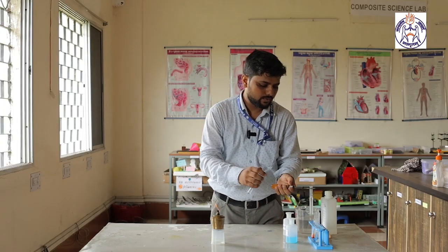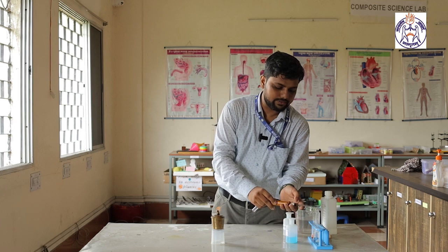So this is how we actually test protein and carbohydrate in different types of food.